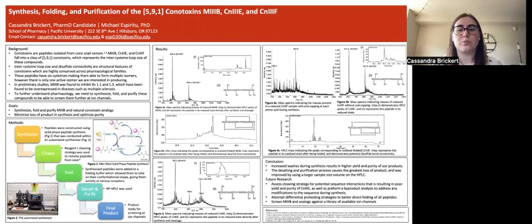Cleaving is essentially just removing the peptide from the resin so that we would be left with just our newly created peptide. We specifically used a Reagent L cleaving strategy. After cleaving, we would need to take our sequence and fold it into its 3D structure so that our peptide would be in its conformational shape and have activity at receptors. For our peptide with all those cysteines, this meant the formation of disulfide bonds that I was talking about earlier.